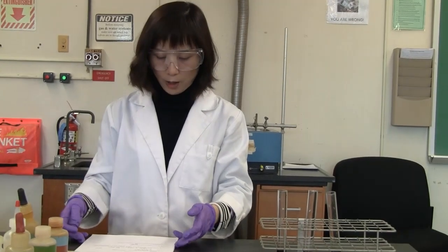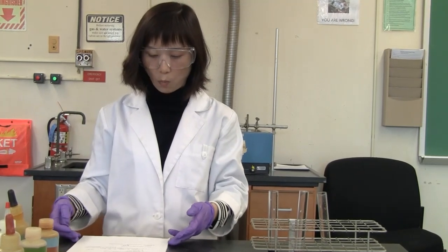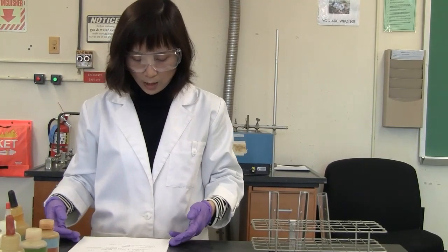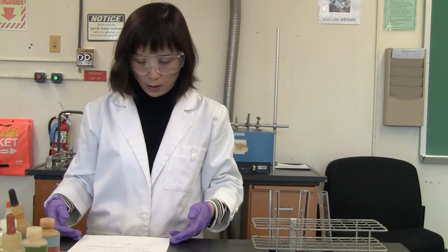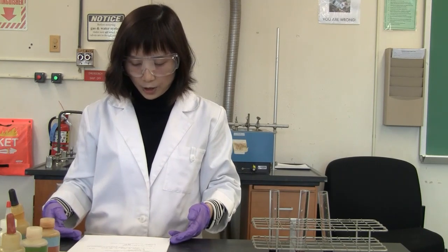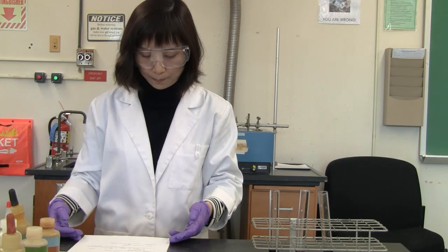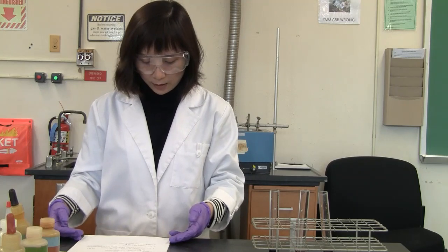Now, question 4, you're going to answer what ion caused the shift. So you need to look back at the equation, think about what you added. Okay, now question 5, you're going to use the Le Chatelier principle to explain the observation. Okay, now move to step 6.